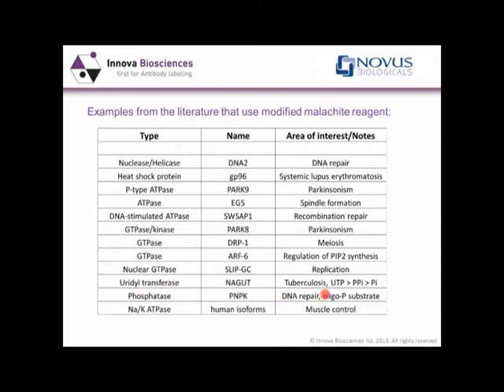I found this example with UTP being converted into pyrophosphate, and in this particular paper excess pyrophosphatase was used to essentially produce the universal product which can be picked up by the Malachite reagent, sodium potassium ATPase.